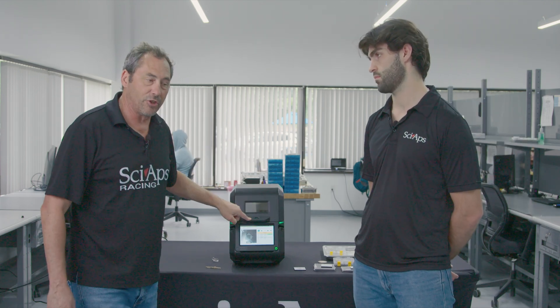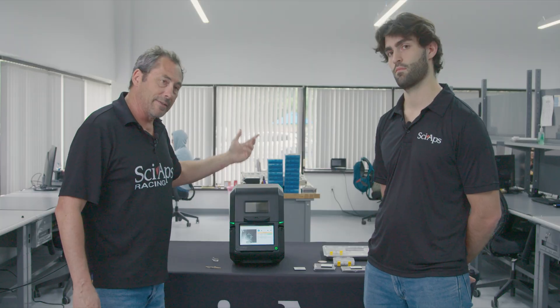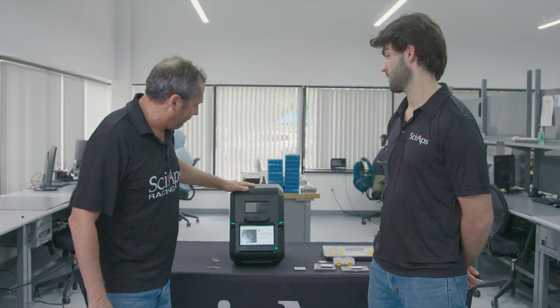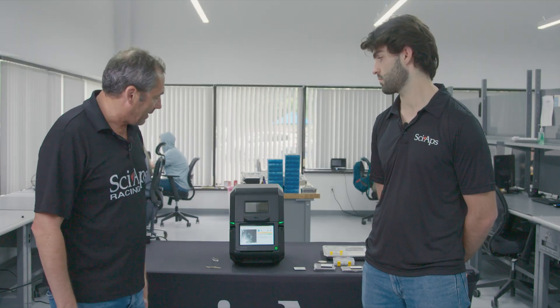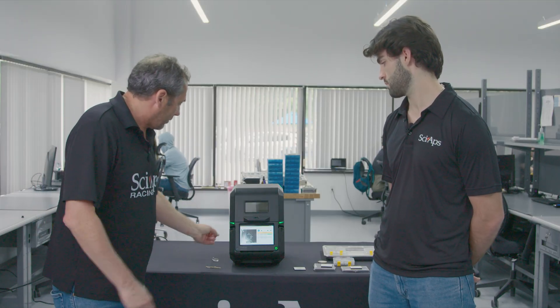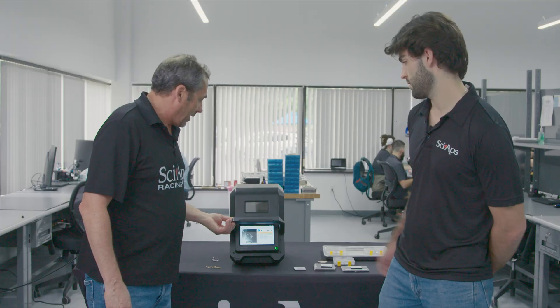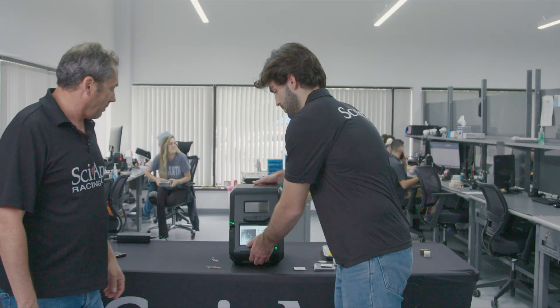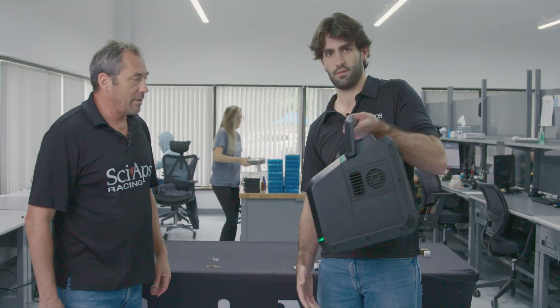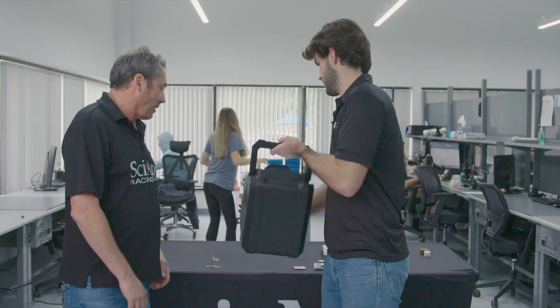It's interlocked, so when this is shut, if you open it during a test, the x-ray is shut off, so it's very safe. It's got a nice leaded glass window, so you can always see your material that you'll be testing in there. It's also got a handle, because it is portable — you can lock the lid and just pick up the whole unit, carry it anywhere you want. Very, very portable.